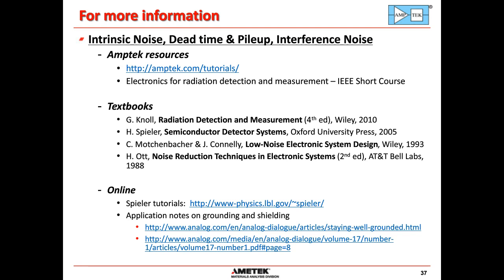The question was, given the fast SDD is pretty immune to noise, is it reasonable to use an ultralight heat sink and fan directly atop the X123 cooler? So the fast SDD is relatively immune to acoustic noise, microphonic vibrations. It is still affected by electromagnetic interference and by intrinsic noise. You can try an ultralight heat sink and put the fan on top of it.